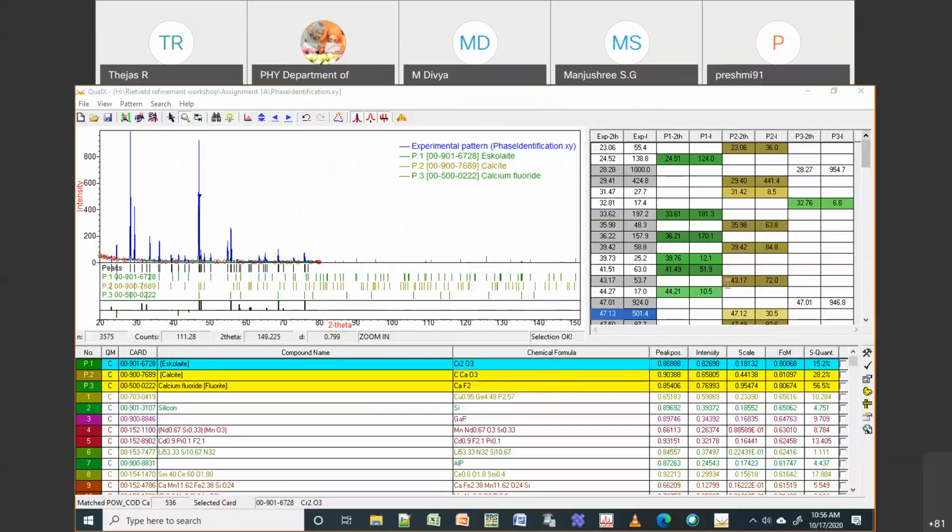Can two samples with different concentration have the same pattern? And if yes, how to differentiate it using XRD? If you have two different constitutions, that means you have two different elements. The intensity of the peak corresponds to the element which is present. For example, cerium oxide will have better diffraction and less absorption.